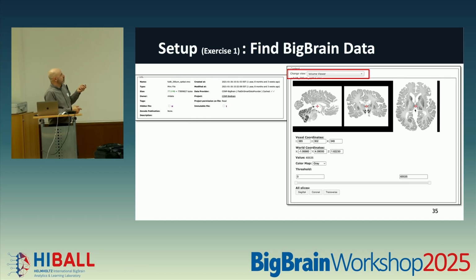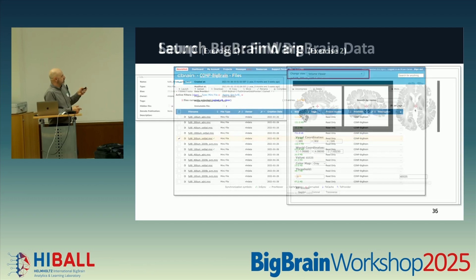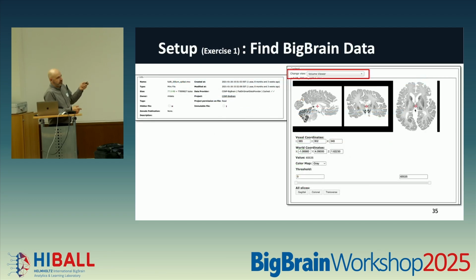So that's the volume viewer part there, but you can also get more specific information. We also have, if you do the drop-down menu, more header information. So if you want to see the header information that's in the file, you can select it. And then we also have a MINC viewer, which is separate, that'll open up another browser window that'll run directly. It'll give you a little bit more fine-grained control for viewing the MINC file. But this is one that's directly within the browser.